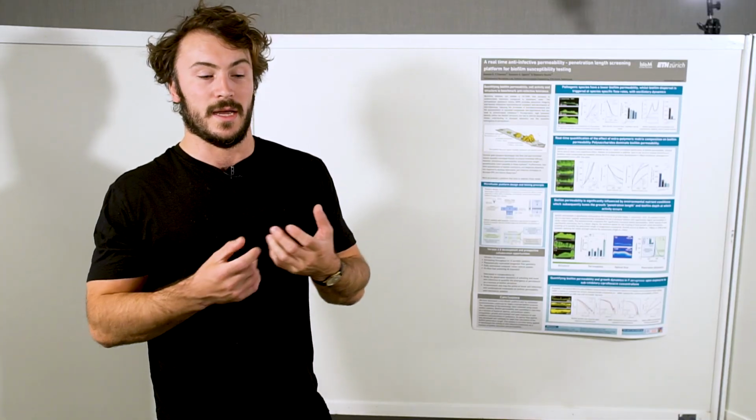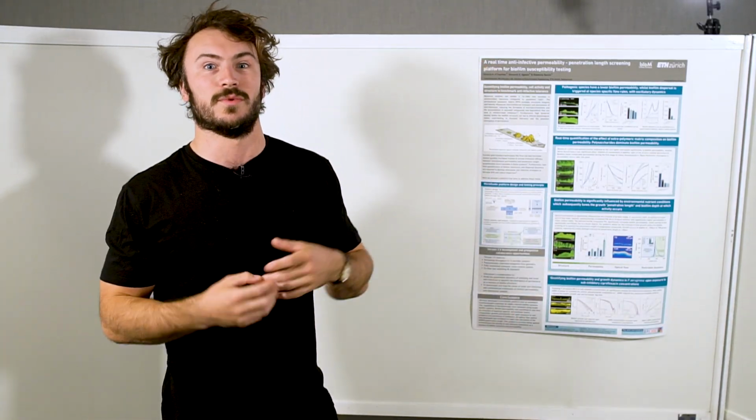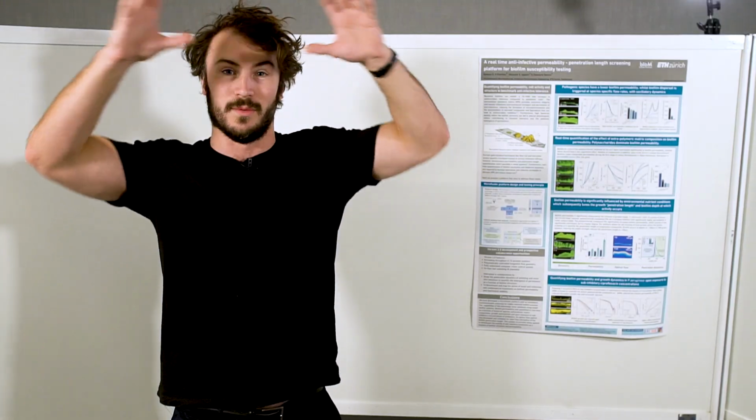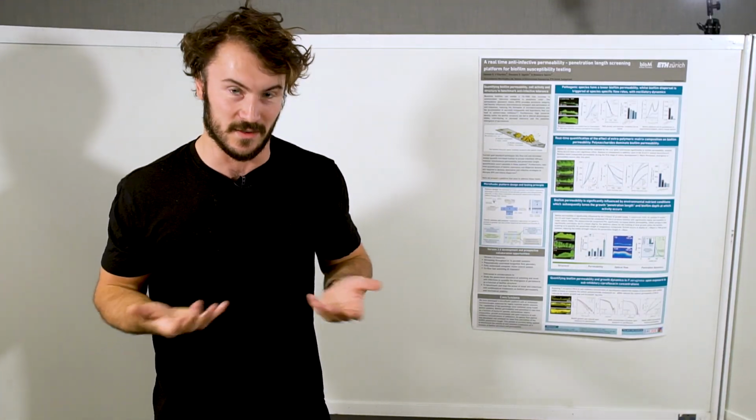Furthermore, within this, we also developed an analysis methodology using something called optical flow, which is where we measure the cross-correlation between two images in a time series. From that, we're able to derive the vector field of movement within the biofilm as it grows. Using this analysis, we're able to localize growth regions within the biofilm substructure. We know that biofilms are also incredibly heterogeneous in their phenotype. This is a method in which we're able to pick out separate parts within the bacterial biofilm where we still have cell activity.